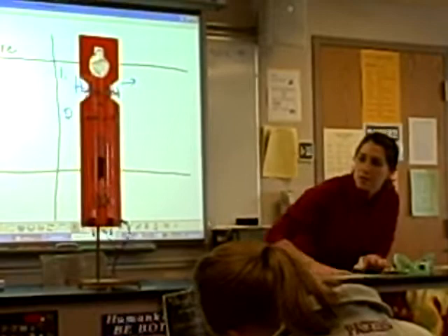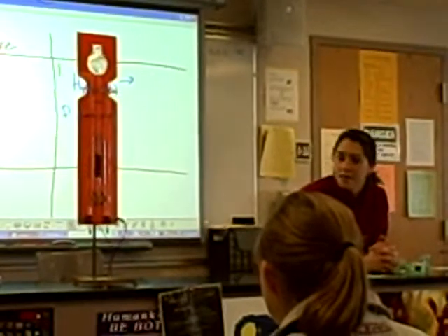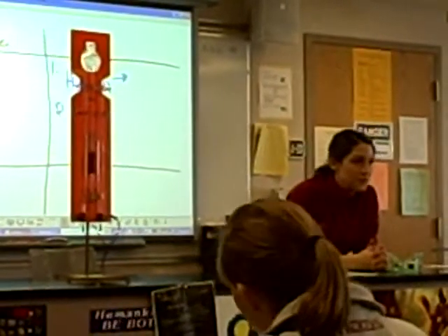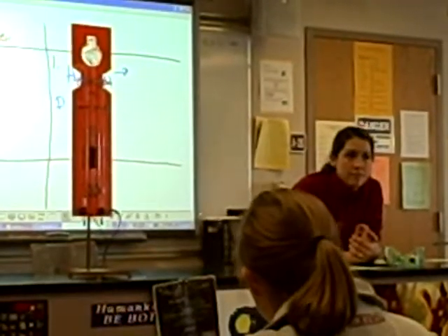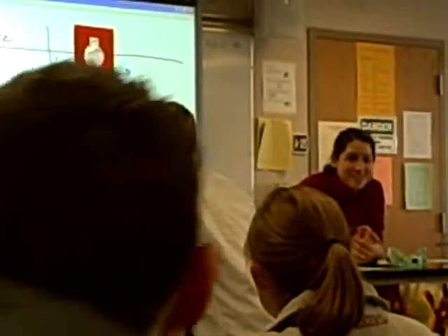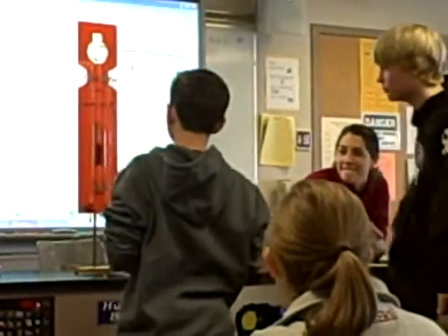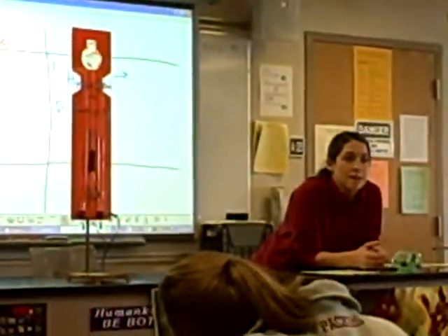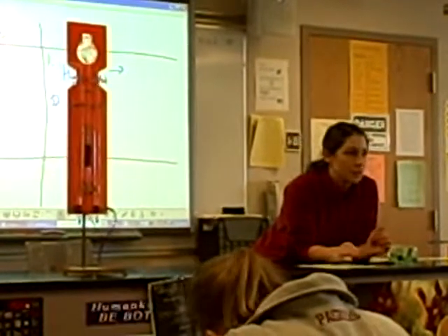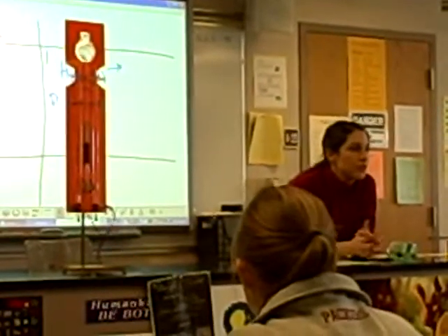Alright, so now let's record what's happening in the Hoffman apparatus. What do you see happening? Bubbles. If you can't see them, come on up and check it out. You get electrocuted if you touch it. Yes, don't touch the metals. Alright, so record your observation. Record that you see bubbles, so you're getting a gas for products. We do this under data? Yep, keep doing it in data. Should we write it underneath that H2O? Yeah, I would just write it underneath there. You're just writing notes for yourself. Is it hot? Yeah.